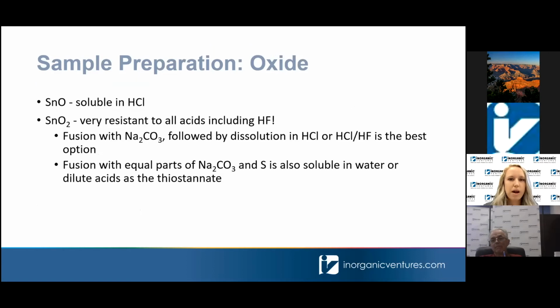So the last sample prep we have is the oxide. Stannous oxide is soluble in hydrochloric acid, no issues there. However, as we talked about before, stannic oxide is insoluble. It's very resistant to all acids, even hydrofluoric.